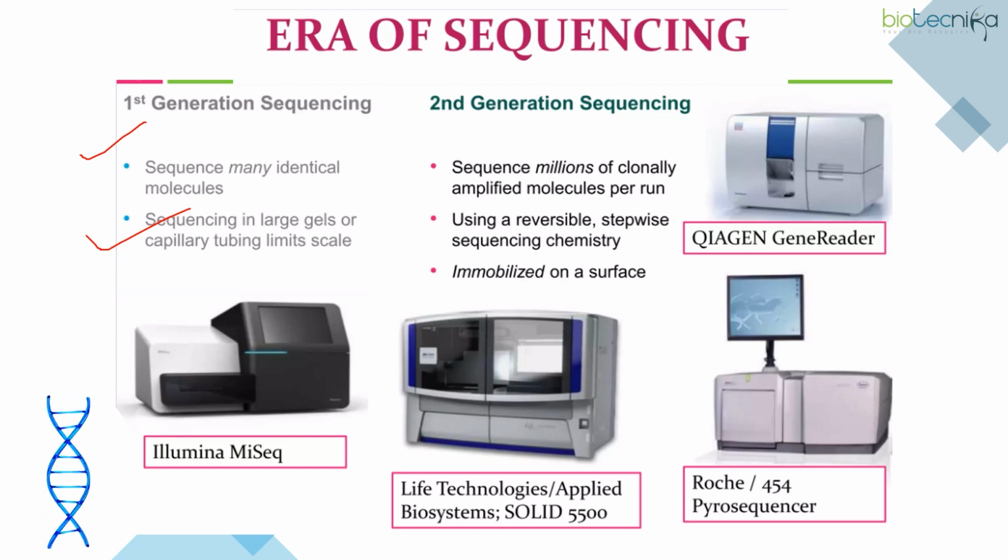We used to take the help of the Illumina sequencing technique. Got it? So this is exactly how the experiment of the specific technique looks. Then we have the next generation, with respect to second generation sequencing before that.